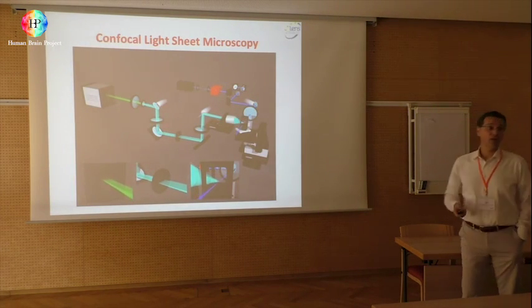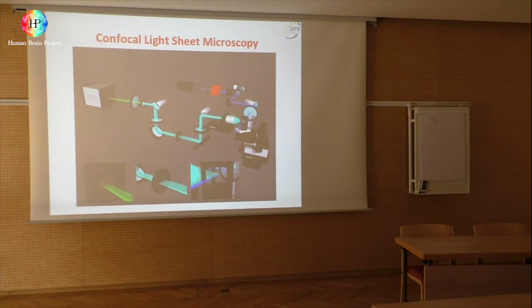This is the system we have developed, which is totally new, because again, the system is not totally transparent. So you have scattering, and you have to remove the scattering. So what we do, we implemented the confocal rejection with the light sheet. In our system, the light sheet was done with this beam which was scanned in this direction.